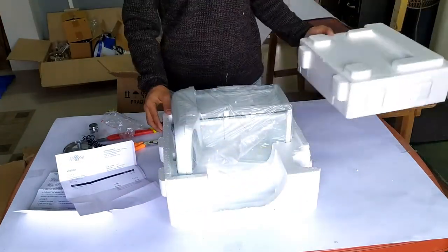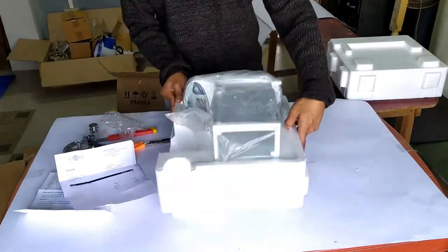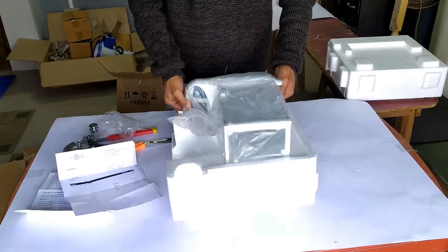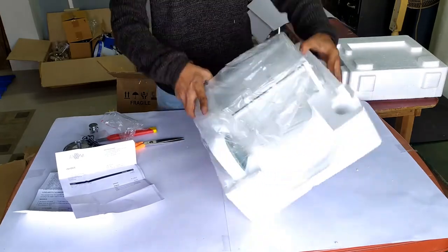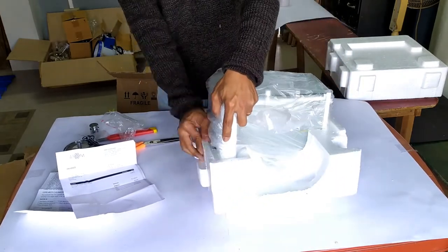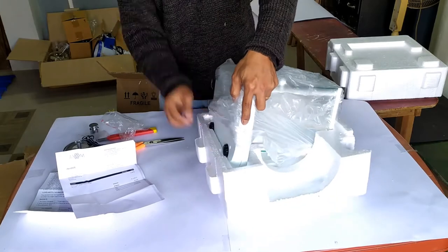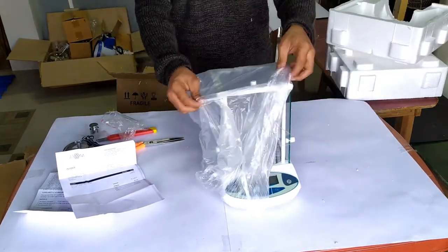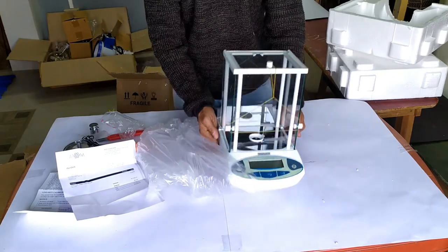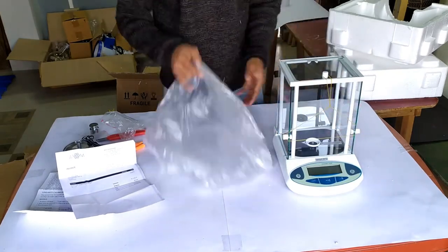As we open the Thermacol box we finally have the weighing scale inside further packed in a loose plastic bag. It has a nice and clean finish to it.